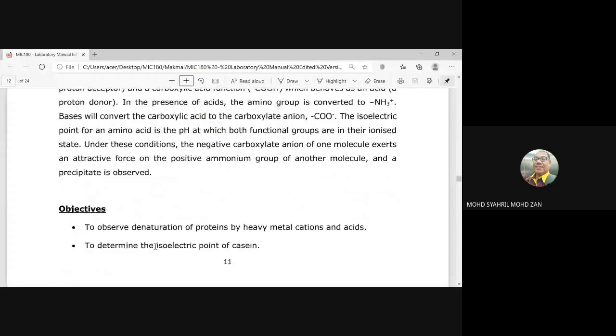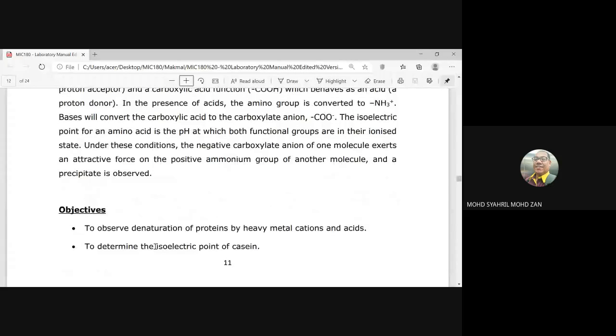Okay. So proses eksperimen ni lebih kepada kalau contohnya awak ada protein ataupun awak ada susu, for example paling mudah, susu awak letakkan sedikit jus oren. So bila apa yang berlaku dekat situ, cair susu tersebut akan menjadi partikel-partikel yang halus. That's what we call denaturation. Okay, itu adalah pandangan dia, alright.